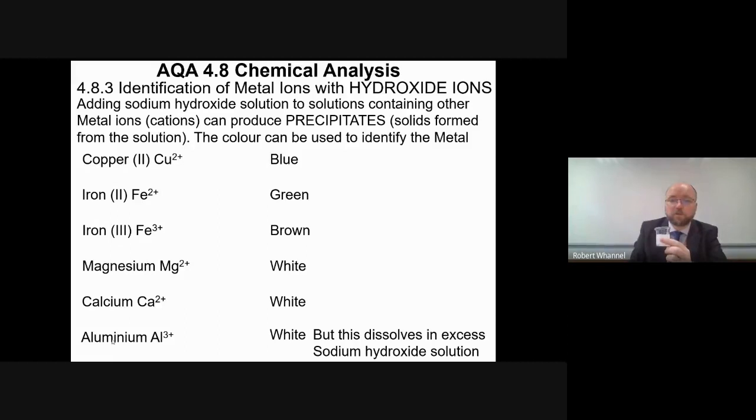So I'm hoping you can all look now and figure out which 2 possible elements could be in here. Well done if you thought magnesium or calcium. This is, in fact, a magnesium ion that was floating in there.